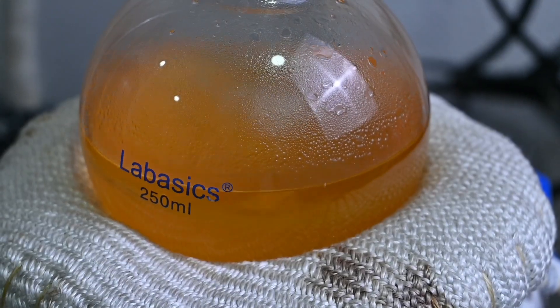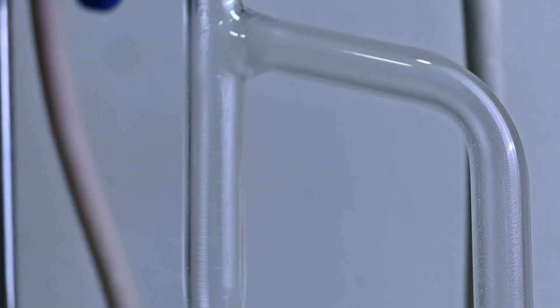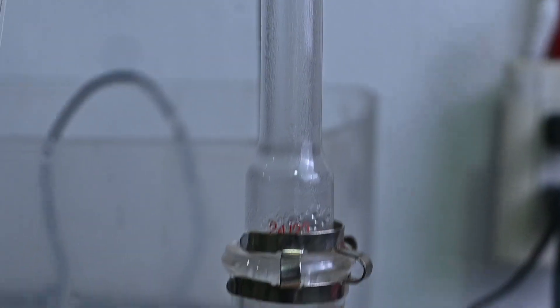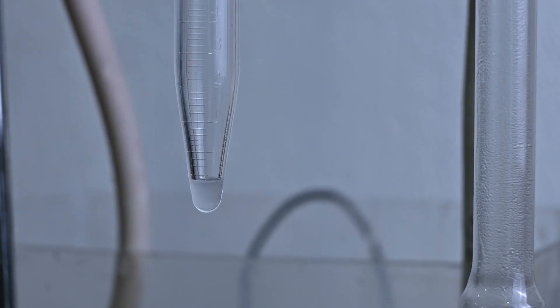Once the mixture starts boiling, we can observe some of the vapors traveling up the tube and reaching the top. At that point, the toluene-water azeotrope will start to condense, and at the bottom of the Dean-Stark apparatus we will see the formation of two layers — the top one made mostly of toluene, and the bottom one in which water will be collected.